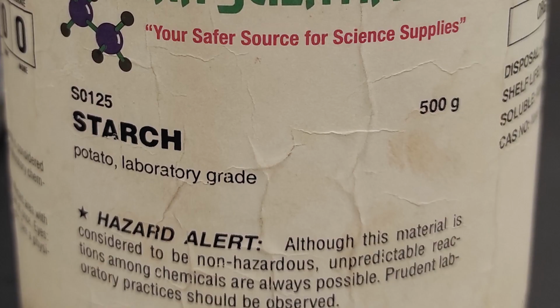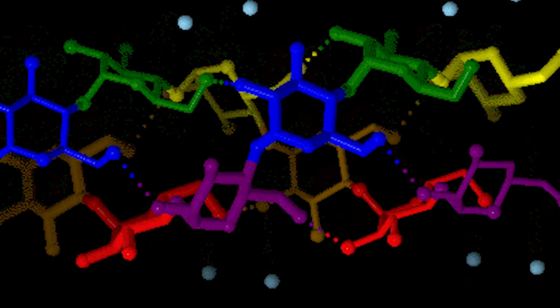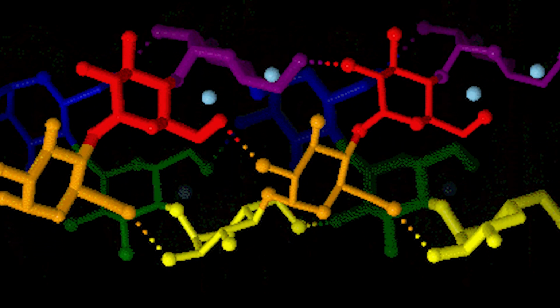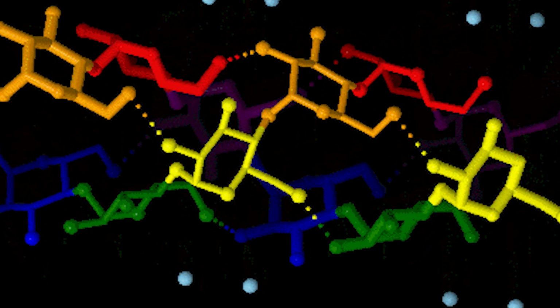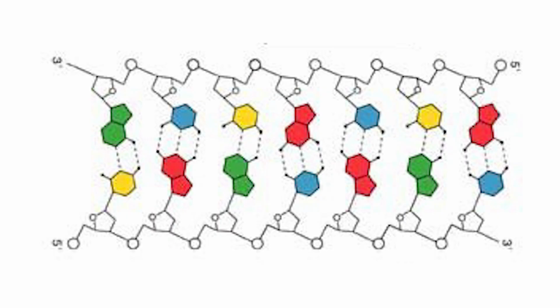The starch indicator, in our case a laboratory-grade potato, has a significant amount of amylose, a long molecule that is created with glycosidic bonds. Its unique shape makes it incredibly important in nutrition, but its shape also makes it very useful in chemistry. Amylose is a parallel double helix, creating a structure that is very similar to that of a spring.